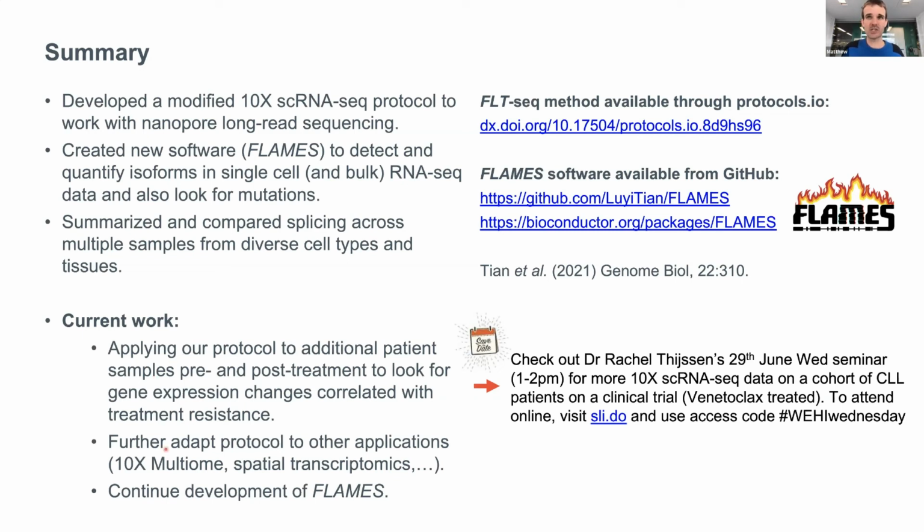So that's an interesting twist that you can hear more about. We've also run this on other 10x protocols. I showed you data where, separately on the same sample, we had ATAC data and we also had the RNA-seq data from the FLT-seq. But it also works perfectly fine on the multiome protocol as well, where now you're going to get both bits of information in the one experiment.